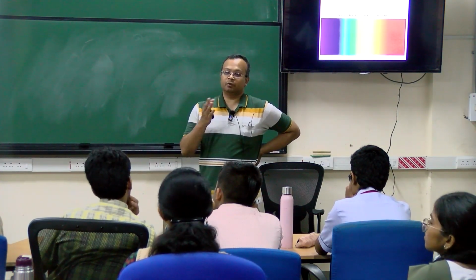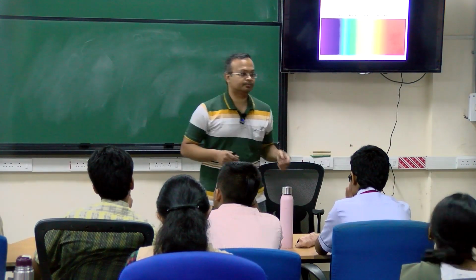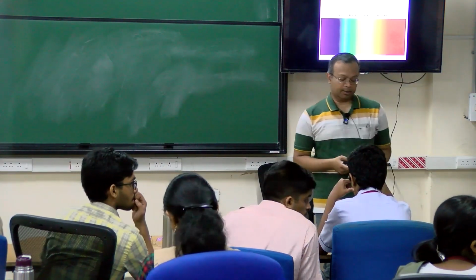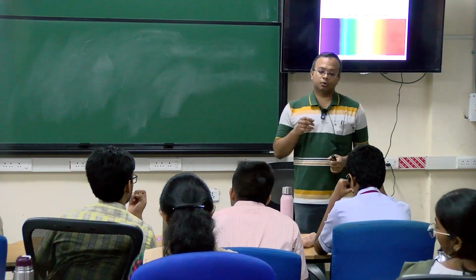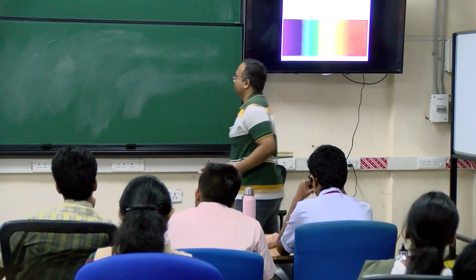Okay. So in fluorescence, what happens is each of these organelles will have a How are you able to actually label the different organelles with? Yeah, that's what I'm saying. So there is a principle called immunofluorescence. Okay, I'll just write it to you.